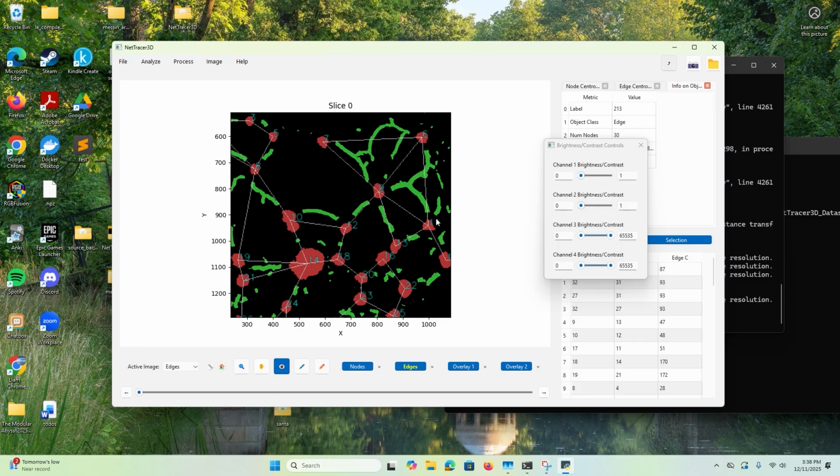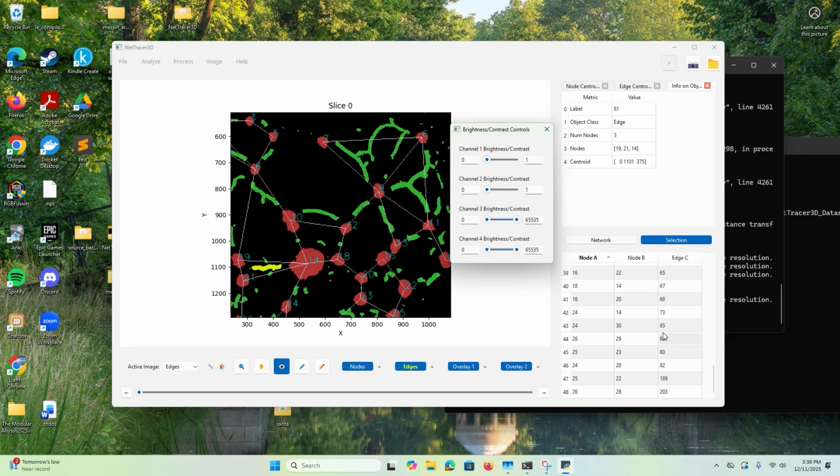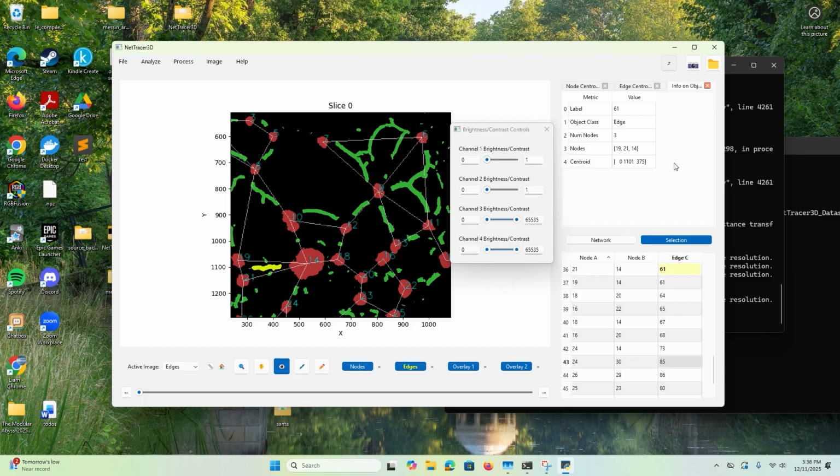And the reason that it looks all weird is because we chose that update the nodes and edges option, and that's just making sure that our edges keep track of what data structure they're connecting. As you can see, when you click it, you can actually see direct network information down here. The upper right table always shows you more informative stuff.